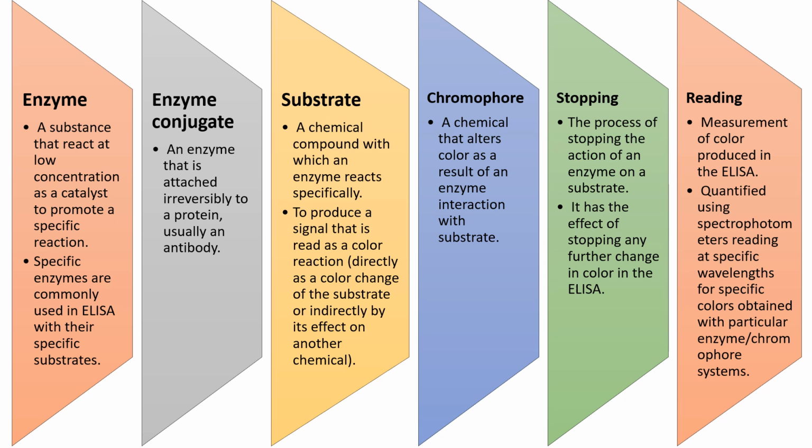Enzyme is a substance that reacts at low concentration as a catalyst to promote a specific reaction. Specific enzymes are commonly used in ELISA with a specific substrate. Then we have the enzyme conjugate, an enzyme that is attached irreversibly to a protein, usually an antibody.